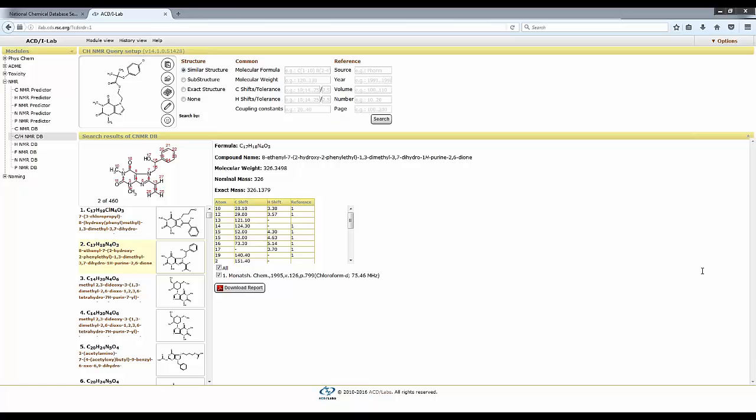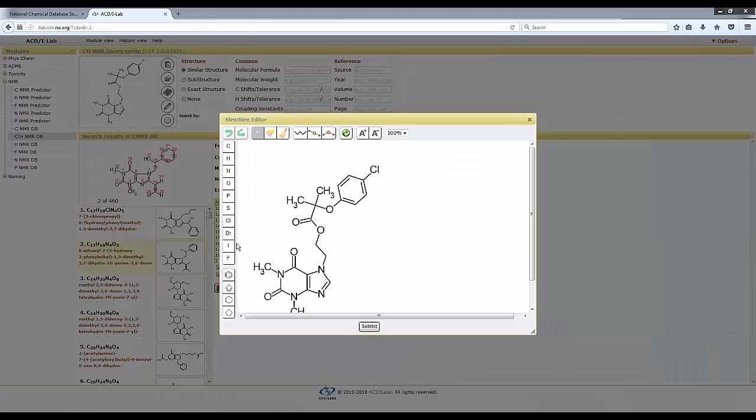Yeah. So, what elements are allowed? In principle, the elements you can use are the ones that appear here. So when I select to draw the structure, and I have these elements, these are the ones you can use. So you cannot use, for example, organometallics or anything else funny. Also, you cannot use salts or whatever. So you need to have, let's say, normal organic molecules.